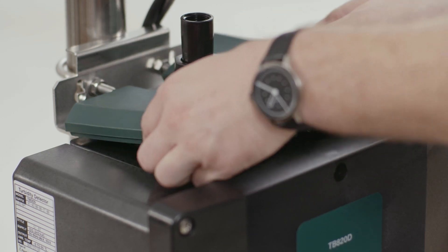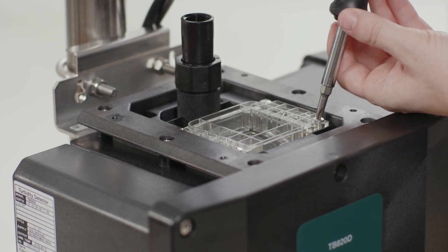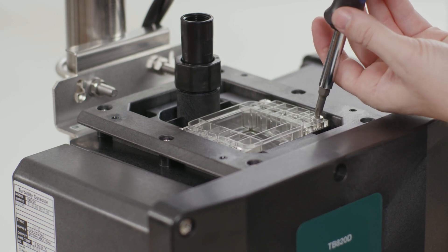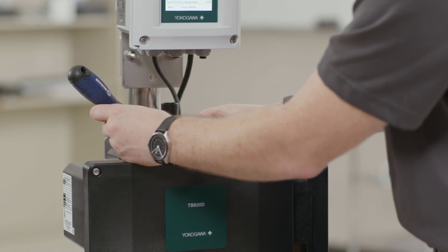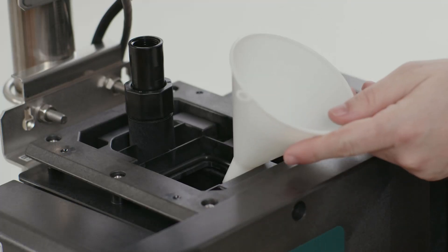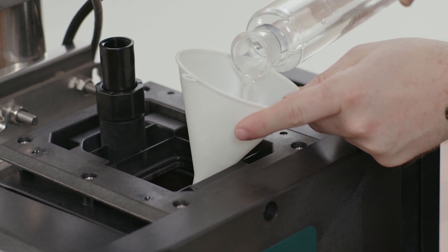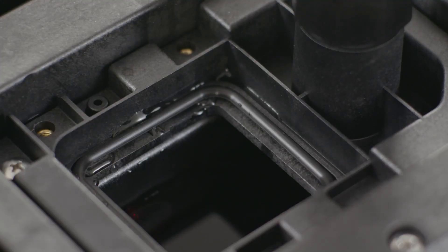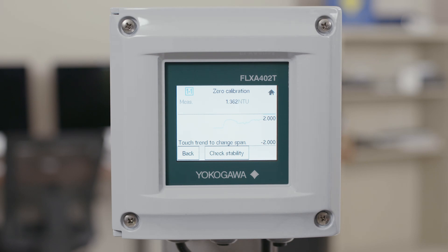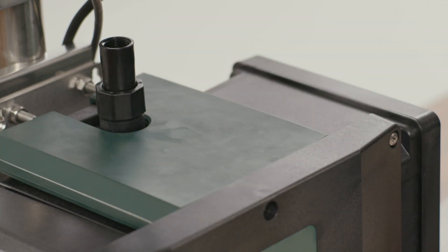Now we can take the top cover off. This will expose the clear window. You want to remove the clear window with the four Phillips head screws on top — these are captive so they stay with it. Once these are loosened, take the clear cover off which exposes the flow cell. With all valves closed on the analyzer — your inlet, outlet, and drain — use a funnel and slowly fill your flow cell with zero water, just past the light source window. Once you have filled the flow cell, give your signal some time to stabilize because you may have introduced some bubbles. You want to let these settle out before you make your calibration. Use this time to put the green cover back on to seal off the flow cell from any outside light.